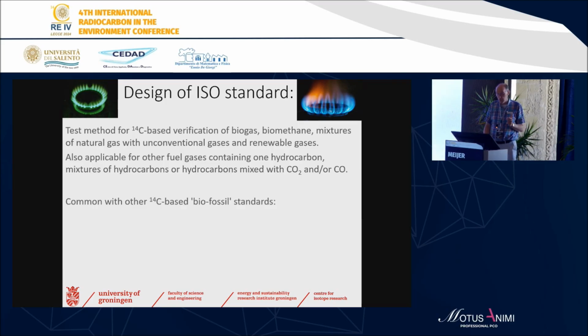They have a lot in common with the existing 14C-based standards, like the definition of the 100% bio, which is crucial for the method, of course. And also, I didn't pay attention to this, but measurement precision, including the pretreatment, is a thing. And also a thing that I didn't mention, the carbon-13 correction is a bit tricky if you mix fossil with bio, because fossil, after all, doesn't have any C14, so correcting with the carbon-13 value for fossil corrects the bio part, whereas it shouldn't.